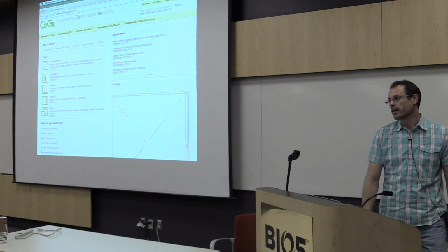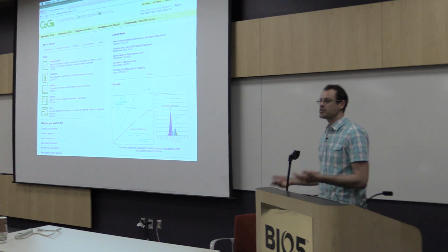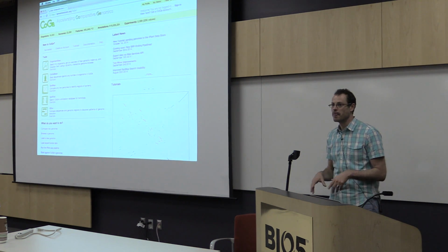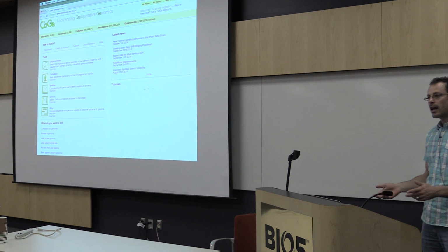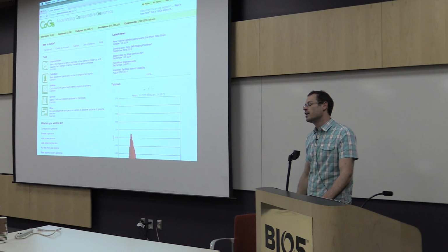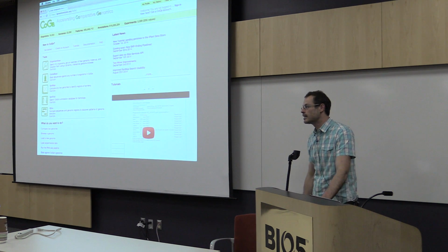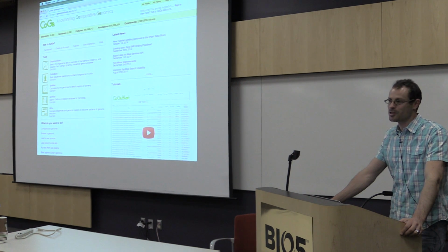We've been working on the underlying technology so that in the same way that we can store thousands of genomes, we can store thousands of what we call functional diversity experiments per genome. We have in place ways for people to add in their data, mix and match it with public data, keep it private, or share it with other users, and if it's made fully public, anybody can use it anonymously. We try as much as we can to make it easy for people to integrate, share, and publish their data. Underlying this, again, is iPlant, and one of the key technologies that we've leveraged from iPlant is their user authentication system.